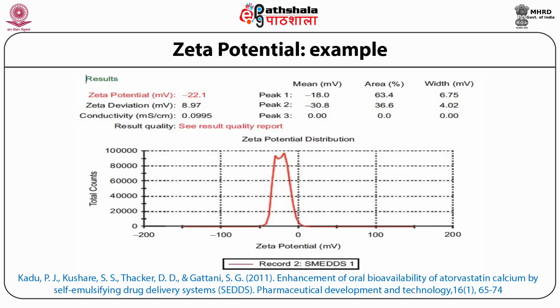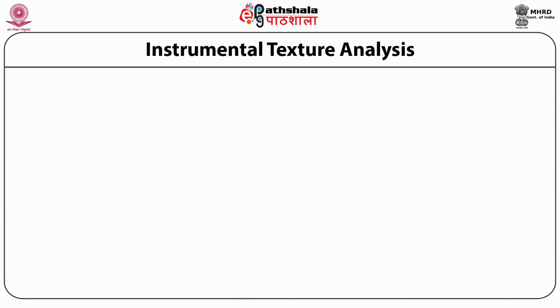The overall zeta potential of this particular sample is minus 22.1 and the conductivity is 0.0995 millisiemens per centimeter.